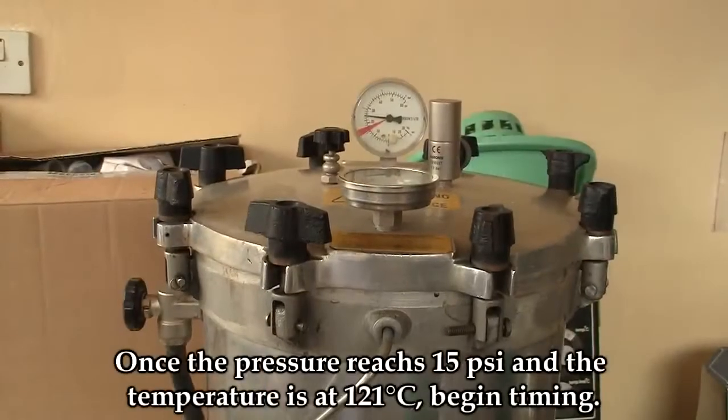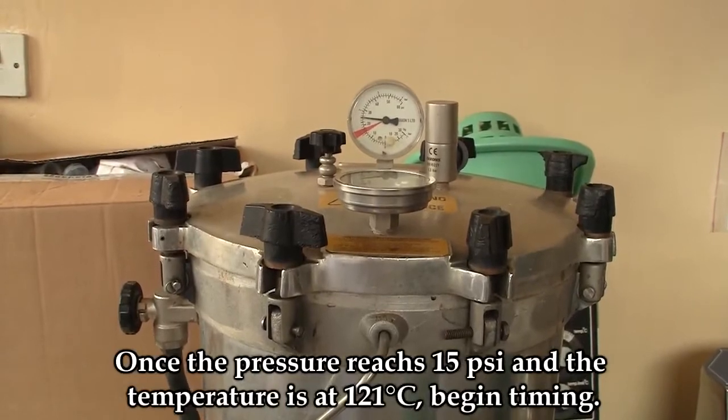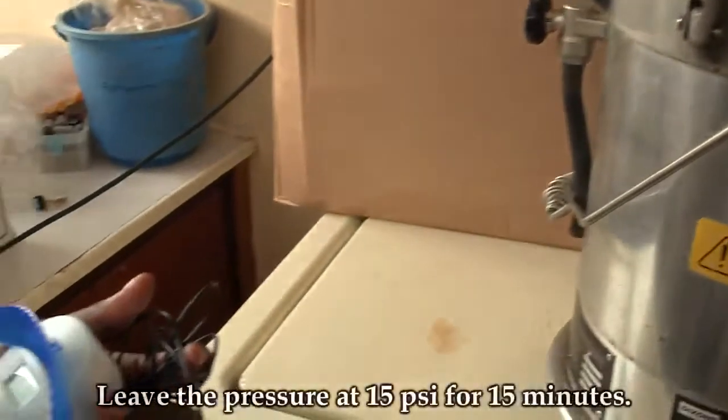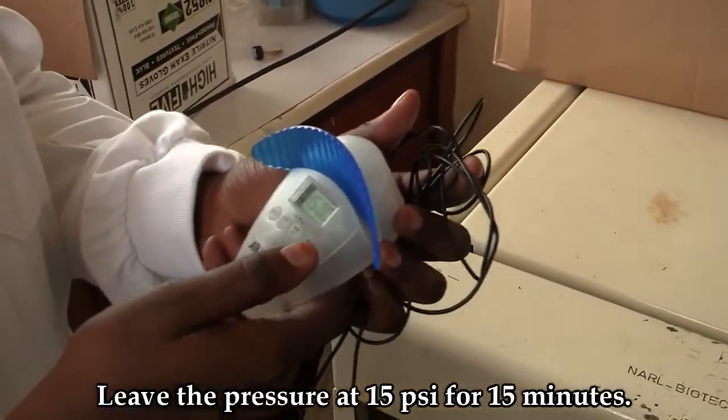Once the temperature is at 121, you begin timing. Maintain this pressure for 15 minutes.